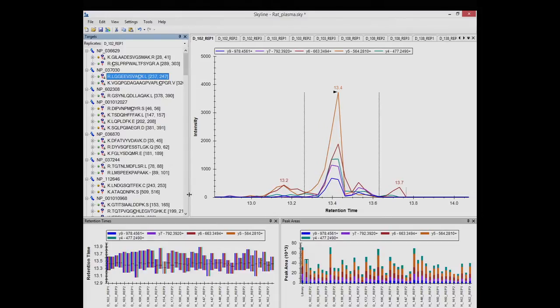This is docking windows. I'm a co-inventor on this patent at Microsoft. So if you hate these things, it's my fault. I like them enough that I put them in this project as well. But it makes it very flexible in how you can lay out your windows.